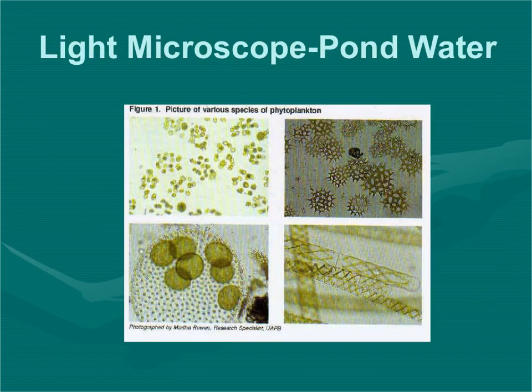Here's another image of different organisms that live in fresh water that you can see through a light microscope. These are different types of algae, which means they're photosynthetic. That's why you'll notice they're green. They use light from the sun, and they collect nutrients from the water, and they can use that to make food, and they can live in water of various temperatures. They can even survive the winter in Minnesota lakes if they don't freeze in the ice.